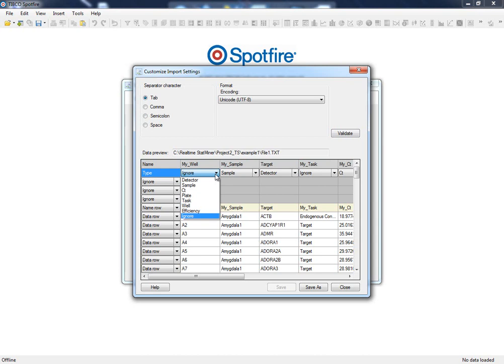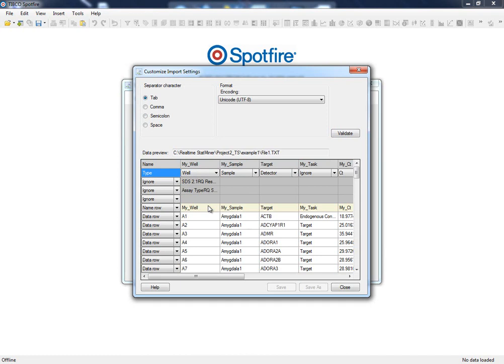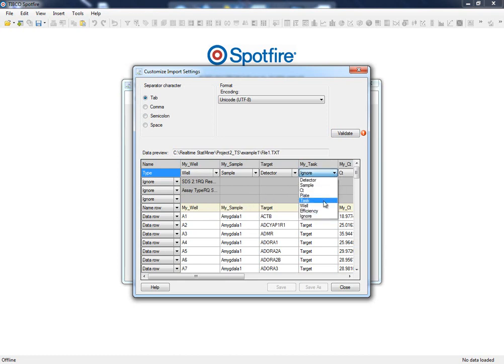For instance, the well position within the plate is not mandatory, but when provided, a virtual representation of the plates will be displayed on the CT quality reports. In these input files, we can also specify the task of the detector, target or reference control, and when they are not provided, all the detectors will be considered targets.